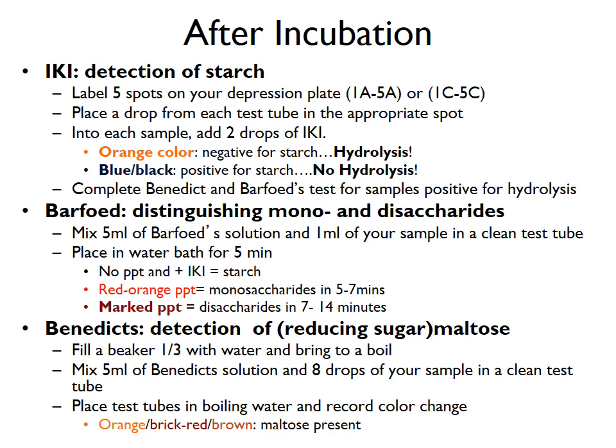So if it turns and gives you a marked reddish brick red precipitate, then it means that you have saccharides in your samples, and usually you see this around 7 to 14 minutes of incubation. Then lastly, a very important test that we do is what we call the Benedict's test, and it's based on the principle of determining the amount of reducing sugar that you have in your sample. Remember, starch can be hydrolyzed to form maltose, so the reducing sugar for starch is the maltose.